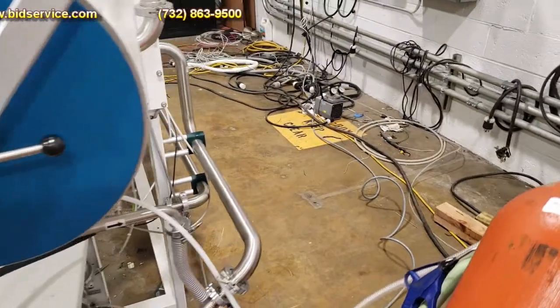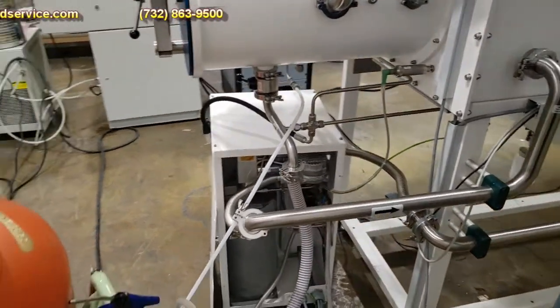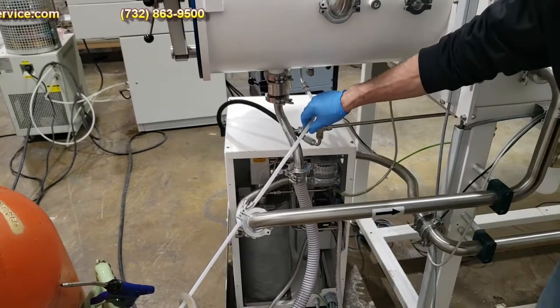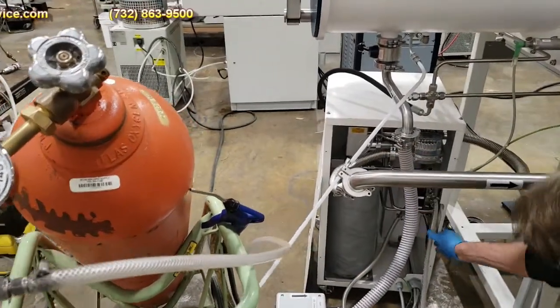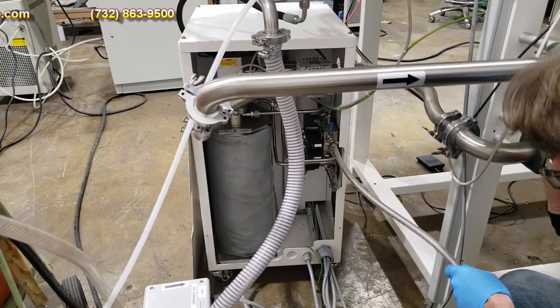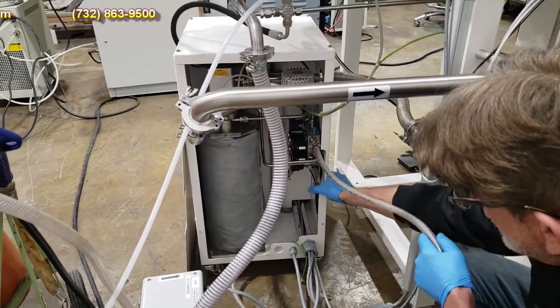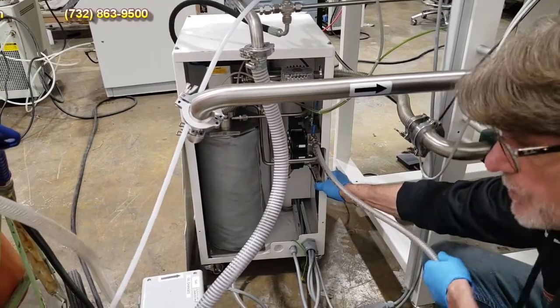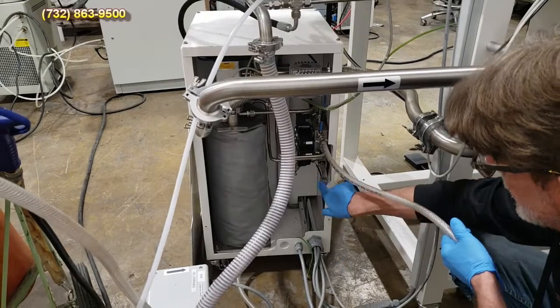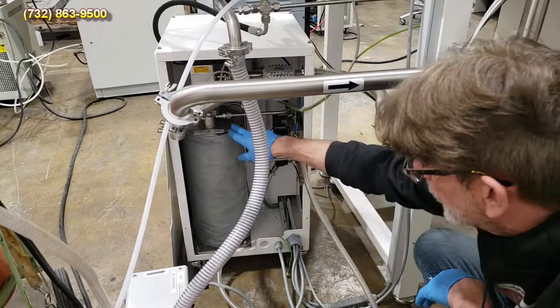Coming around the back here. What they're doing here is they're purging both antechambers using the gas cylinder. You have a line coming in here, then you have another line down here that is labeled inert gas, coming into the manifold and that's used to the box. There's also a line down here where you'll hook up your regeneration gas — it's 95% nitrogen, 5% hydrogen. You need the hydrogen in order to purify the copper catalyst that is inside your purifier.